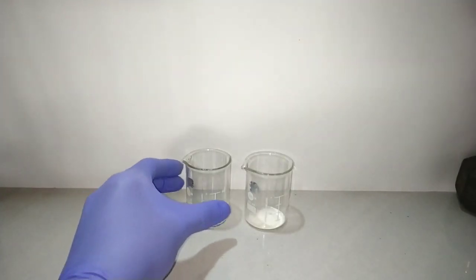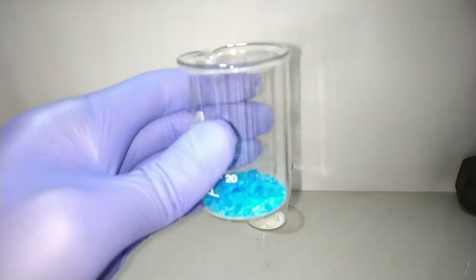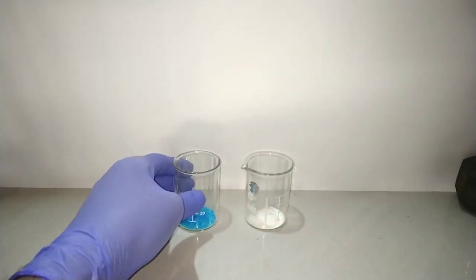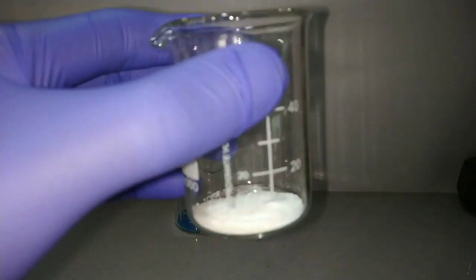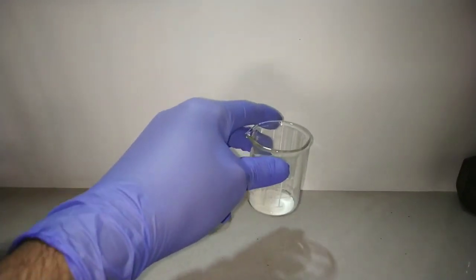I have 2.4 grams of copper 2 sulfate pentahydrate pre-weighed and placed in this 50 milliliter beaker. In the other beaker I have 2 grams of sodium metabisulfite.